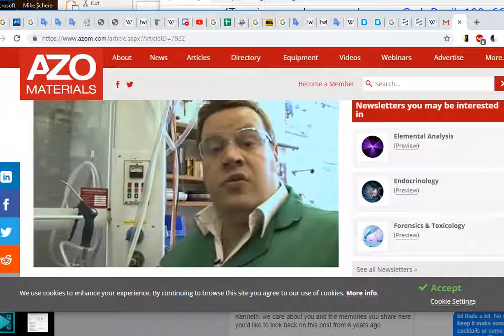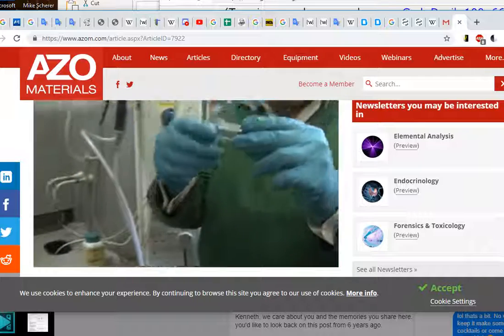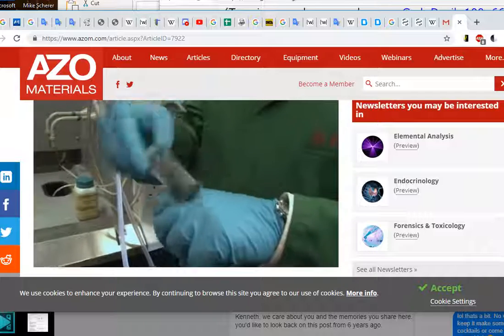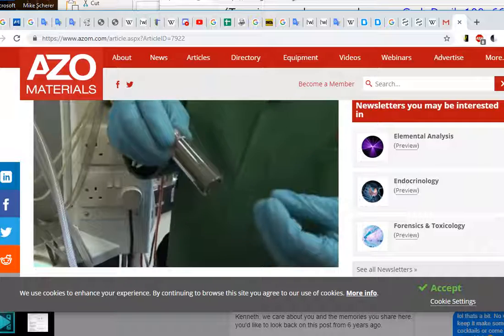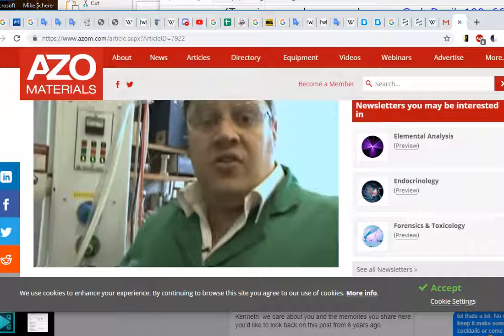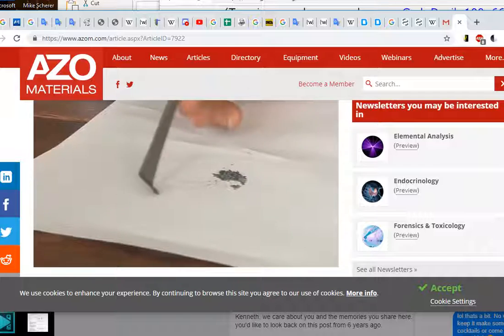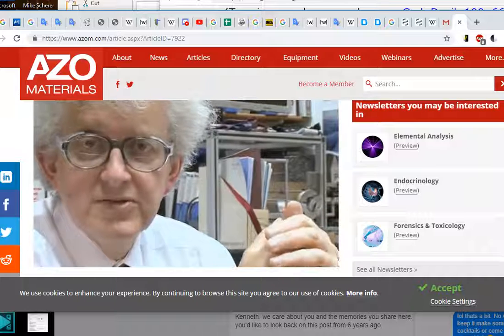So what we're going to do is a reaction with iodine, and today we've ground some iodine, so it's normally found from chemical suppliers as really nice large crystals. But what we want to do is a reaction with it where we need to make sure that the surface area of the iodine is really, really large, so that all of it can react very, very quickly with the other component.